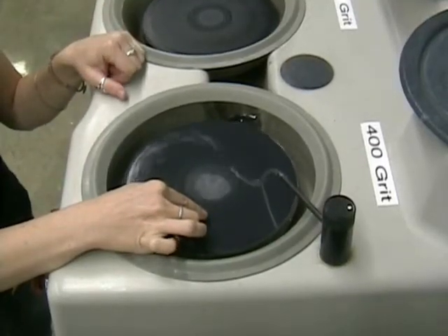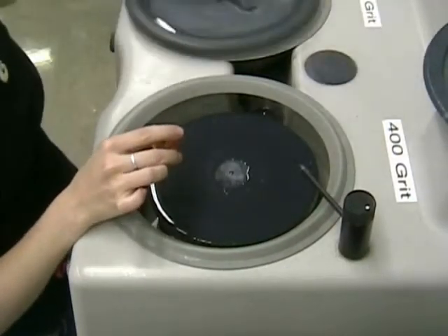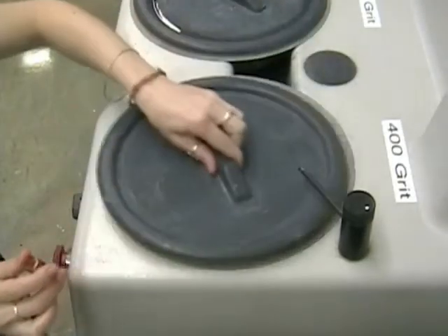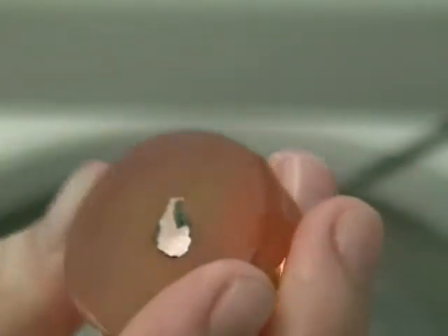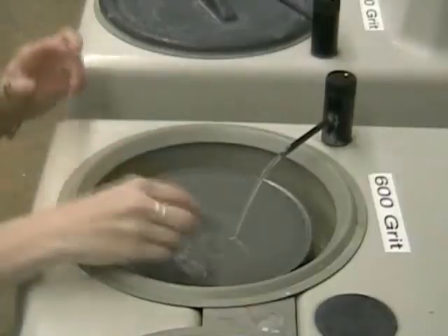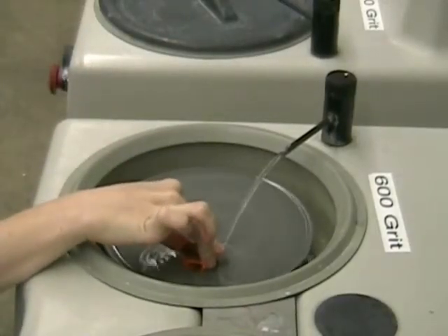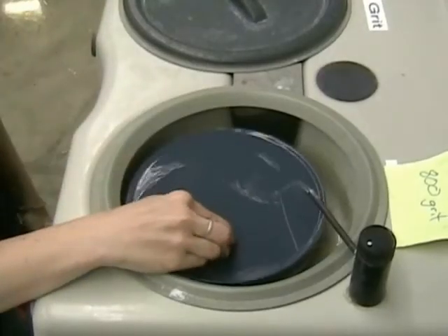Now move to the 400 grit, which is slightly finer. Turn the water off, put the lids on, and rinse it off. You can see that the sample is slightly less scratched and a little bit more shiny. Repeat this process for the 600 and 800 grit wheels.